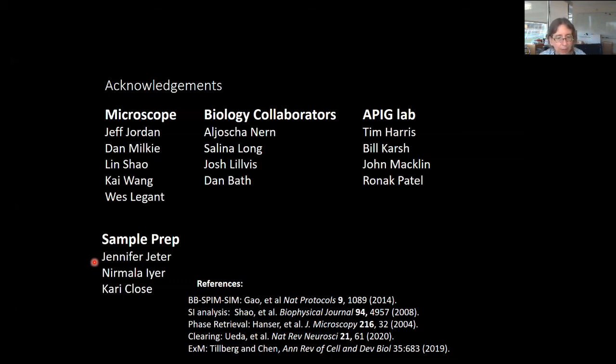I'm not fully versed in everything that Paul and Josh did, but they did a lot of work to get that 8x expansion of Drosophila tissue to be stable over the imaging time. What that tells you is two things: they got it to be stable, and it wasn't stable before that. It was exactly the problem that you're describing, which is that over time the hydrogel would shrink. Because these are big volumes, they image over a couple of days, and that could be bad.